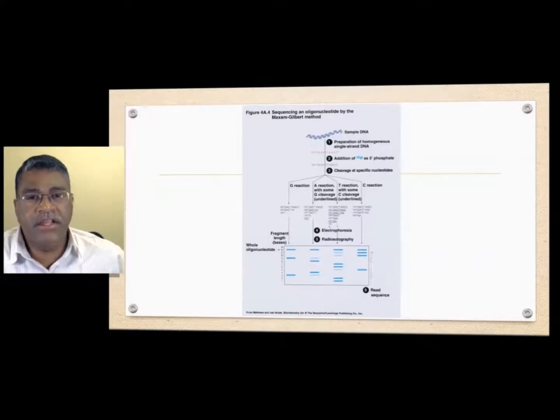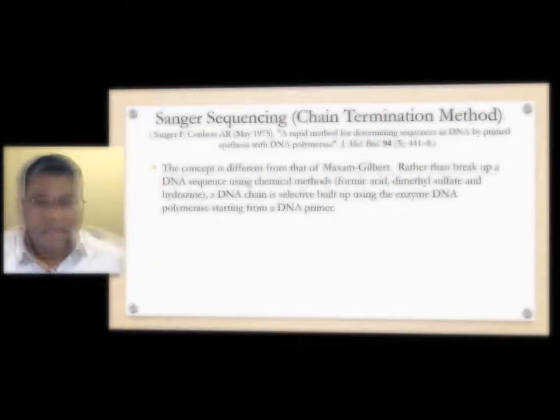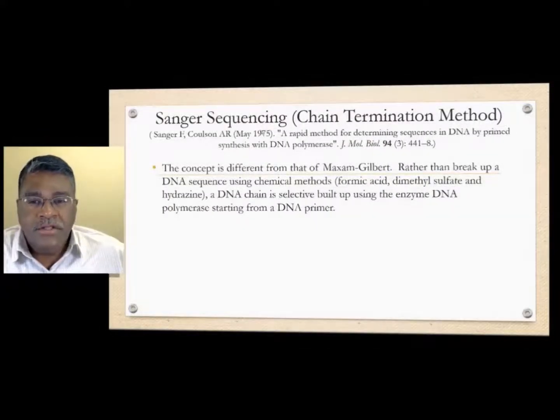turns out is a superior sequencing method. And the Sanger sequencing method was published a little earlier, and it is what is called the chain termination method.